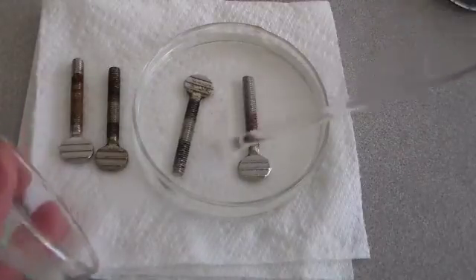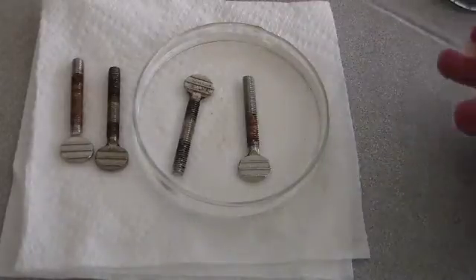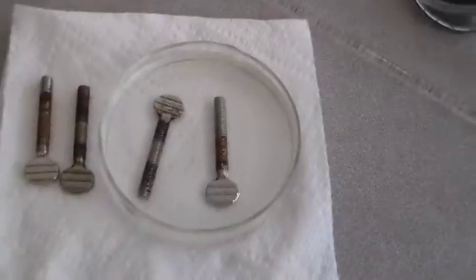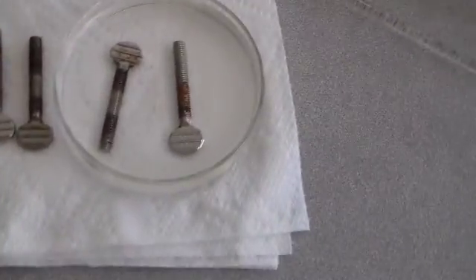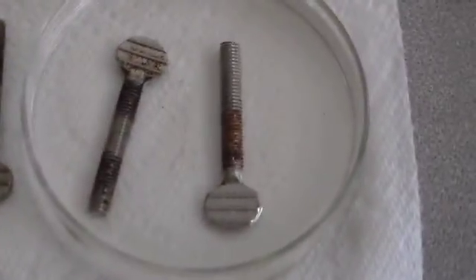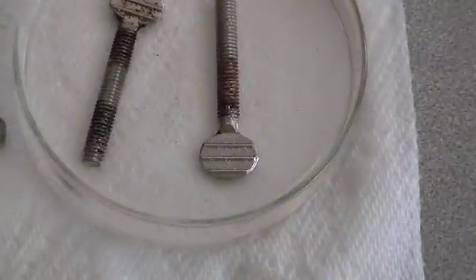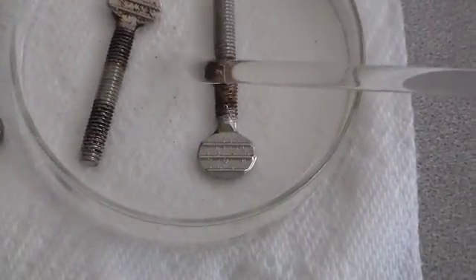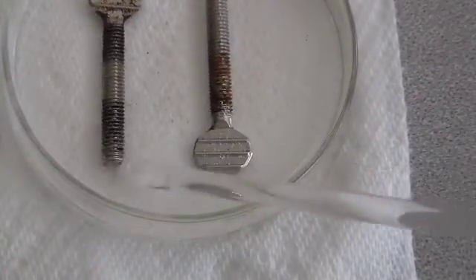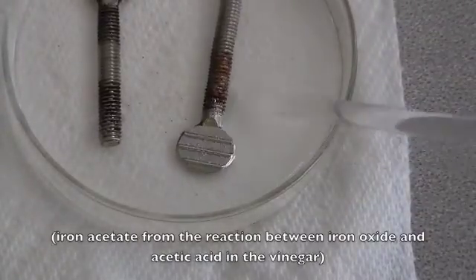Okay, you can see some flakes — you probably can't see it that well, let me zoom in. You can see some flakes, pretty small, but you can see them right there. So that's probably maybe iron acetate that has formed, or maybe just the rust falling off.